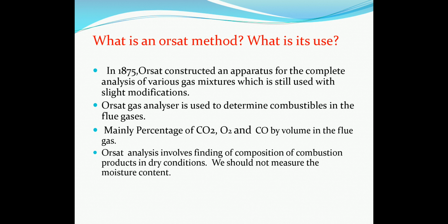Mainly percentages of carbon dioxide, oxygen and carbon monoxide by volume in flue gas can be determined using this Orsat method. Orsat analysis involves finding the composition of combustion products in dry conditions. So there is no need to determine moisture content while flue gas analysis is being carried out.